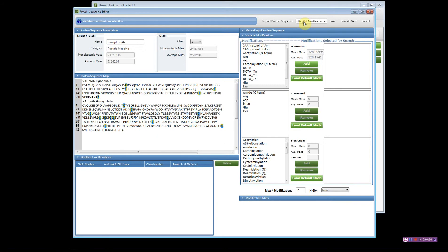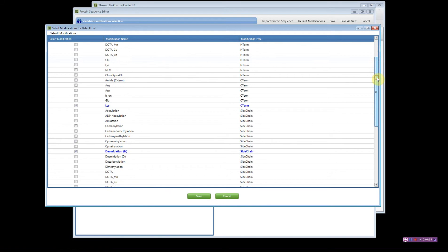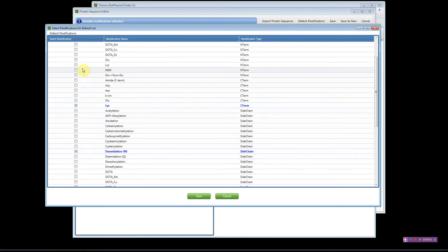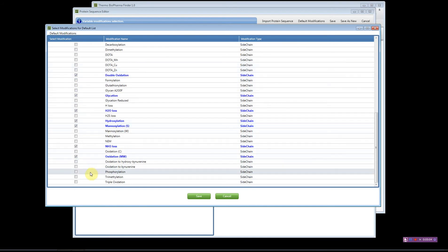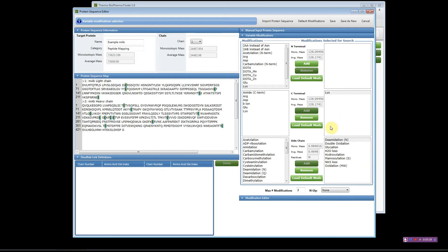The software has some default modifications you can access by clicking here. You can scroll down and customize this list to create your own default list — our recommendations are highlighted in blue, but you can choose any of the available modifications. To use the default list, click on 'default modifications' and it will automatically load all selected modifications, providing a quick way to add multiple modifications at once.